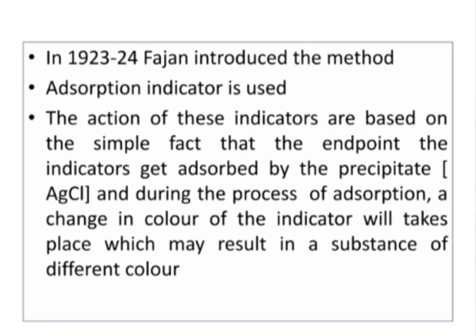When sodium chloride is titrated with silver nitrate, excess chloride ions get adsorbed on the silver chloride precipitate, forming uniform layers. Thus, the primary adsorbed layer of chloride ions holds the secondary adsorbed layer of sodium ions. After the equivalence point, the silver chloride adsorbs excess silver ions as the primary adsorbed layer, with nitrate ions in the secondary adsorbed layer.